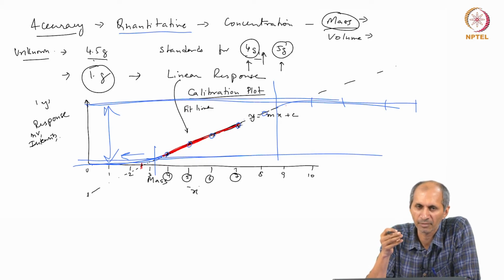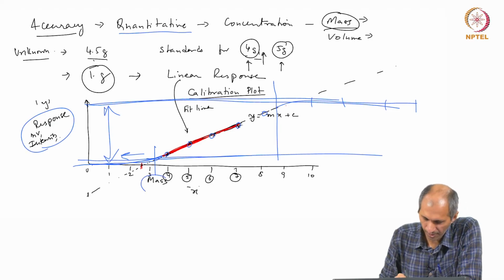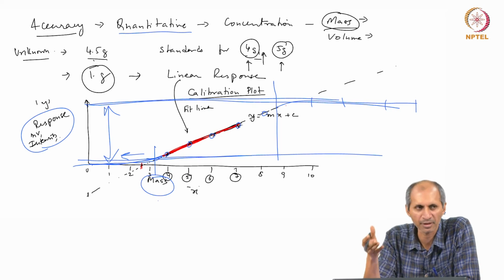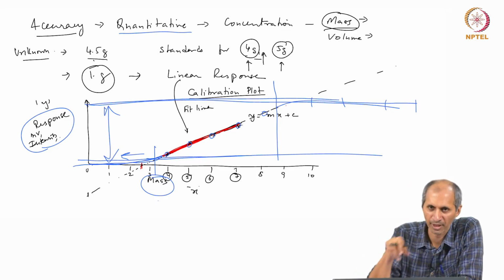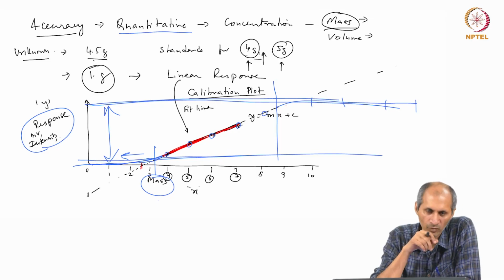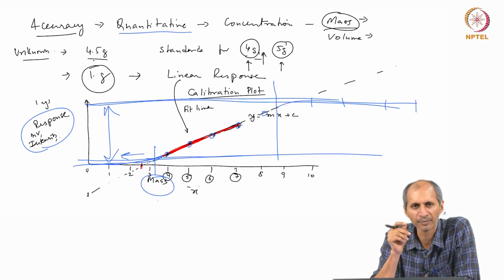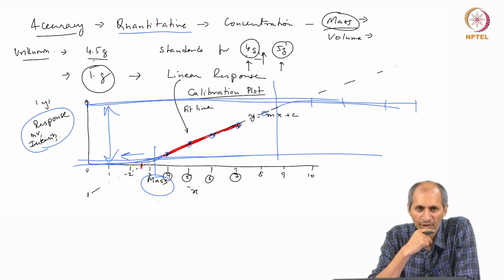First of all, it is a method in which you link your response to the actual measurement unit that we are using, because in pressure transducer based devices like a balance, the instrument is not measuring mass, the instrument is measuring something else that has to be calibrated to the mass. Okay. And almost all instruments are like this. A pH meter for example is measuring hydrogen ion concentration, but it is actually measuring some current or voltage that is changing in the electrochemical system, and so on. So, these are all things that you have to check.